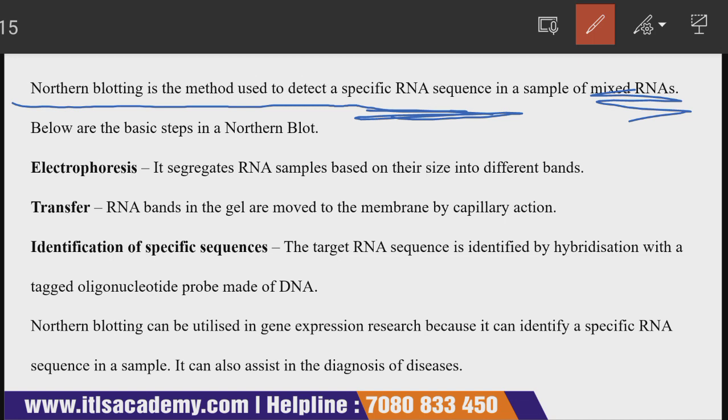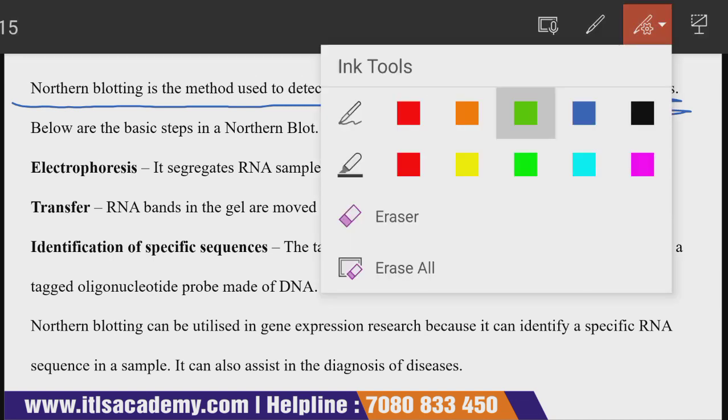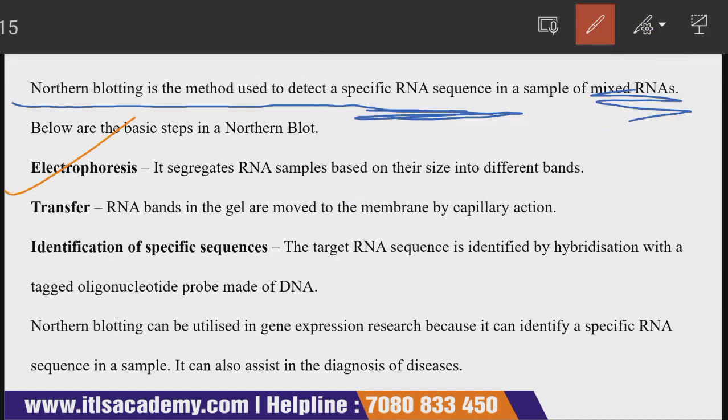Again, there are the following steps in the Northern blot. There would be three steps. The first step is electrophoresis.